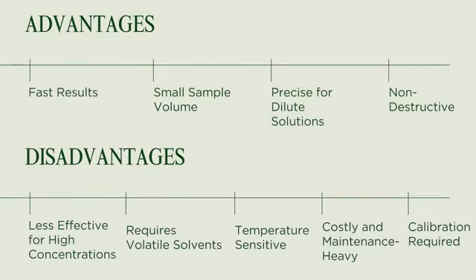These are its advantages and disadvantages. Advantages being it provides quick and real-time measurements based on vapor pressure differences, making it suitable for fast analysis. It requires very small sample volumes, typically microliters, making it ideal for limited or precious samples.